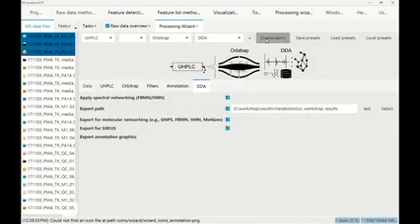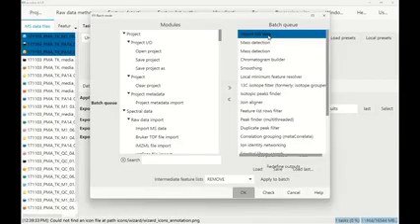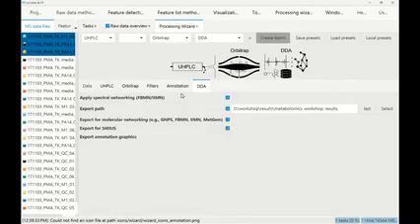So you click on Create Batch. Sorry, yeah? Local presets is grayed out in my case. Is that normal? Yeah, local presets is grayed out if you don't have any local presets.